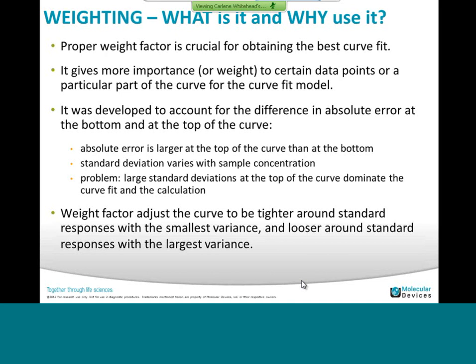Weighting will affect the influence of the data point at each concentration and give importance, or more weight, to certain data points or a particular part of the curve fit model. Weighting has been developed to account for the difference in absolute error at the bottom and at the top of the curve, because generally the absolute error is larger at the top than at the bottom. This means that the standard deviation varies with the sample concentration.